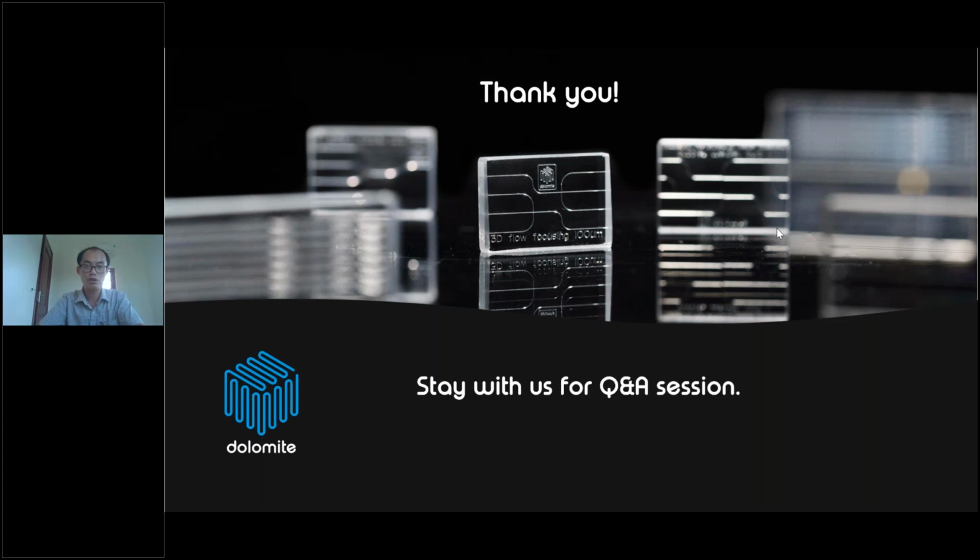After post-formulation, we can dry to achieve dry liposomes by using traditional methods like evaporation, a normal evaporation process at low temperatures, as you can use in lab or R&D with lab equipment.